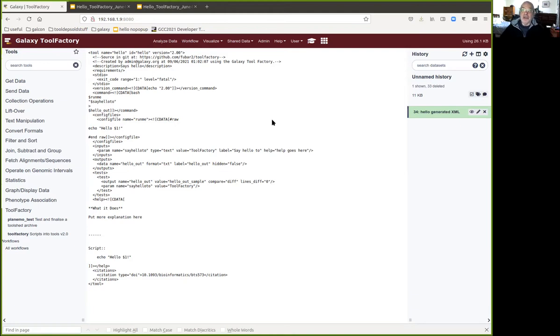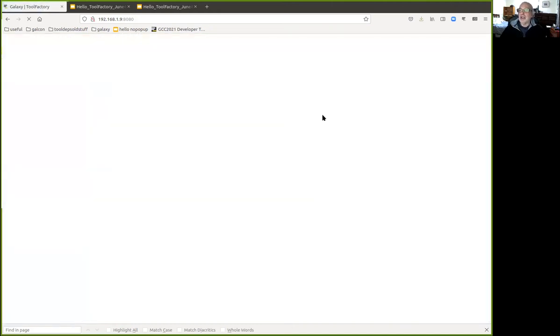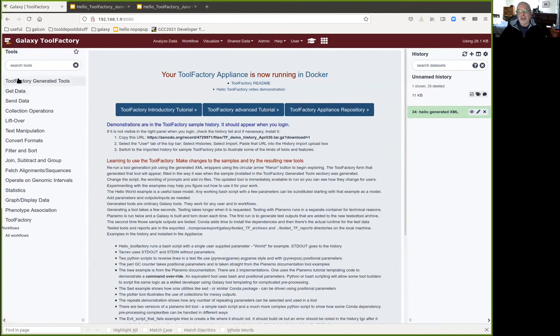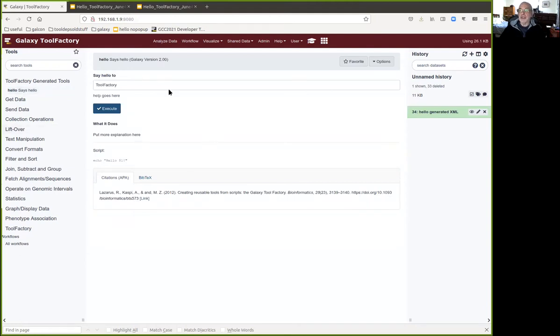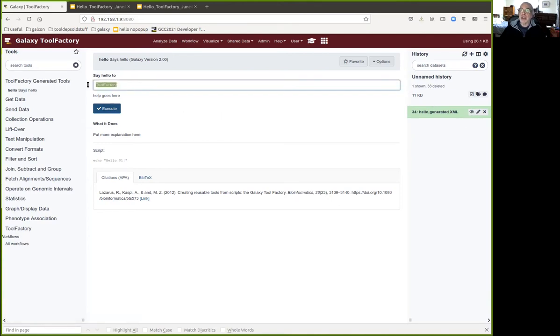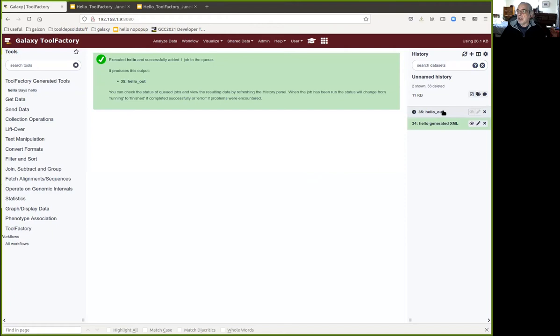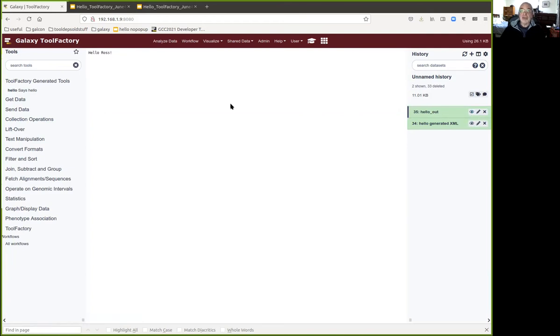Let me show you something really interesting. If I click on 'analyze data', you may notice something's changed: in the tool menu, there's a new submenu with a new tool. If I click on that new tool, I'll see the tool we just created. The text 'say hello to' came from the form. The 'what it does' section has the explanation we typed. It's a normal Galaxy tool. Let's run it — I'll change the input to say hello to myself.